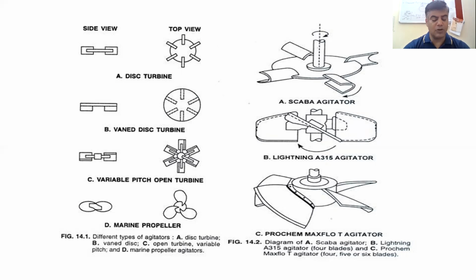Impellers all help in breaking foam bubbles in the head space of the fermenter. This foam formed during the fermentation process can cause contamination problems, and these problems are avoided by the use of impellers. They make a homogeneous mixed environment, mixing the organisms and breaking the bubbles and foams to make equal environments.